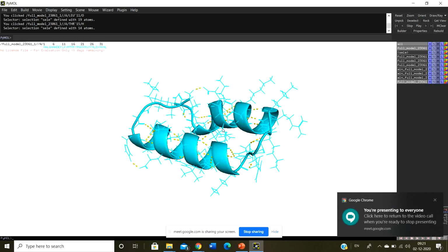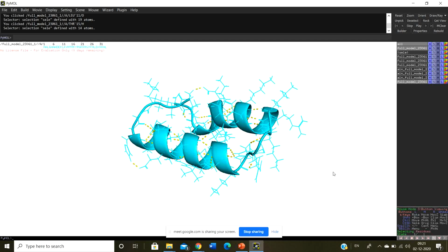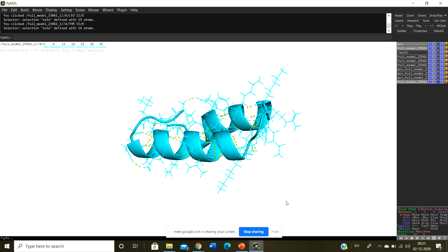So this is the option to find out the polar contacts. Now one drawback is that if you have water molecules, sometimes when you're doing molecular simulations, you are going to have a lot of water molecules. We need to perform the simulation in a water environment, because our body is full of water, so we can't perform the simulation in vacuum, because water also gives a lot of other help. Once we start with the drug designing part, we are going to learn about why water is important.